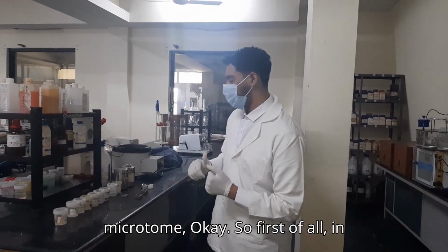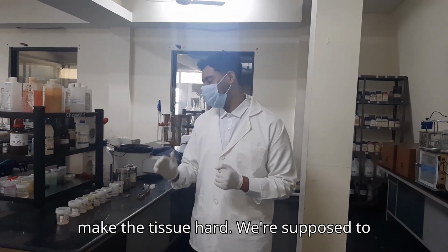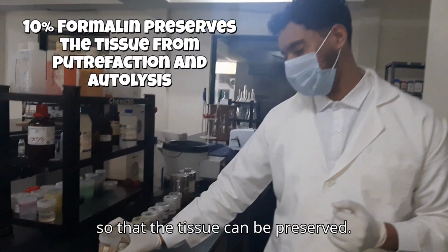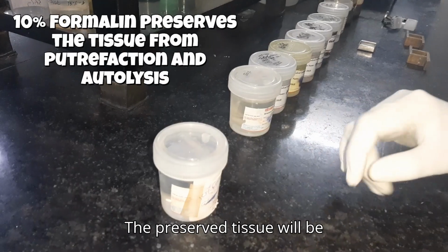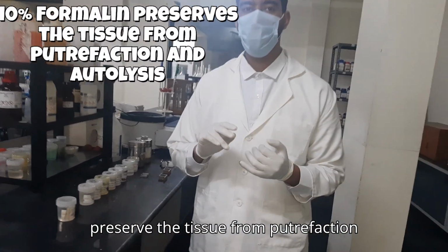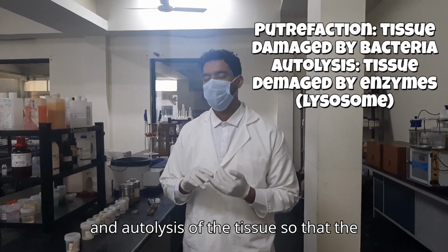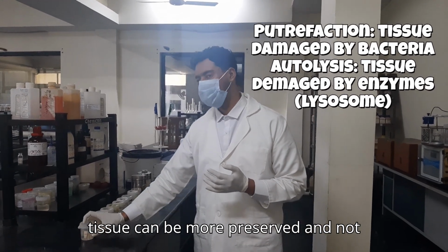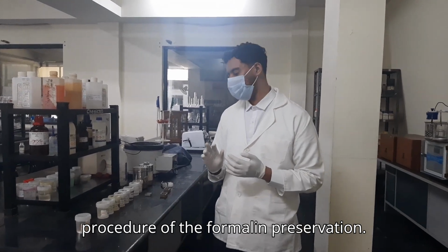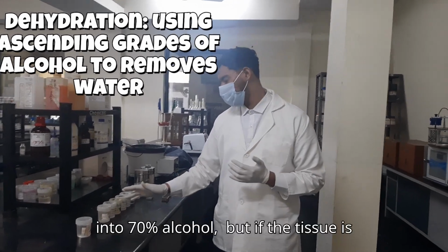In order to make the tissue hard, we are supposed to receive the tissue in formalin, so that the tissue can be preserved. The preserved tissue will be in formalin so that it is protected from bacterial putrefaction and autolysis, so that the tissue is better preserved and not damaged.